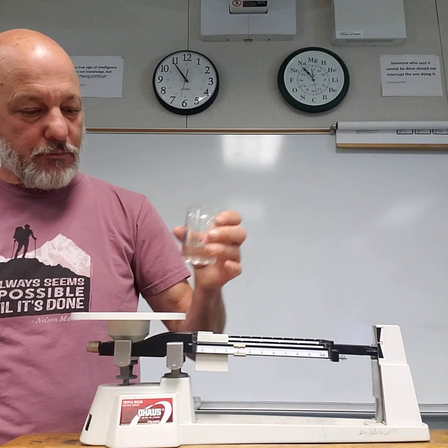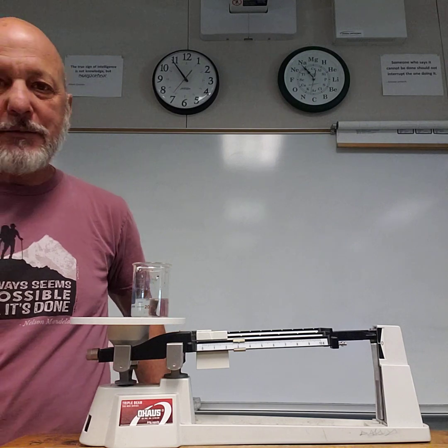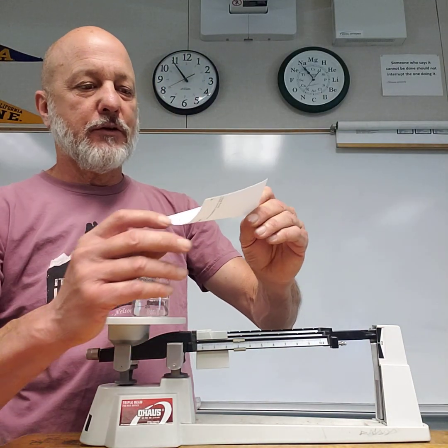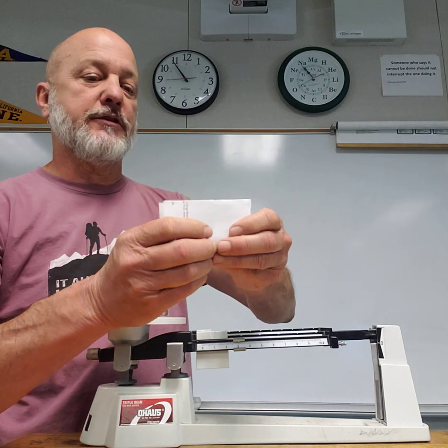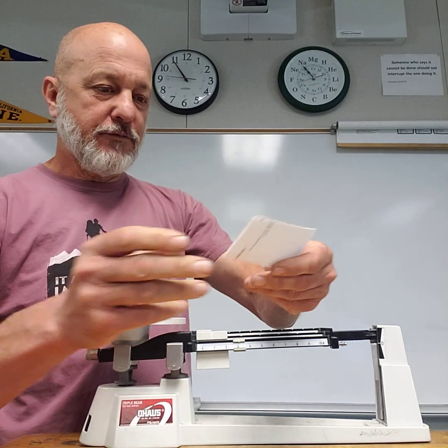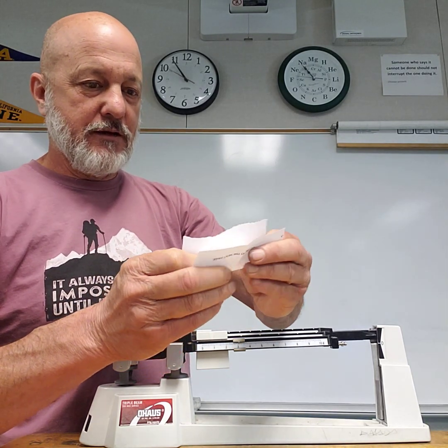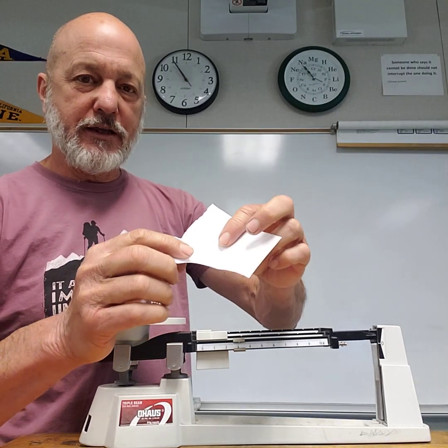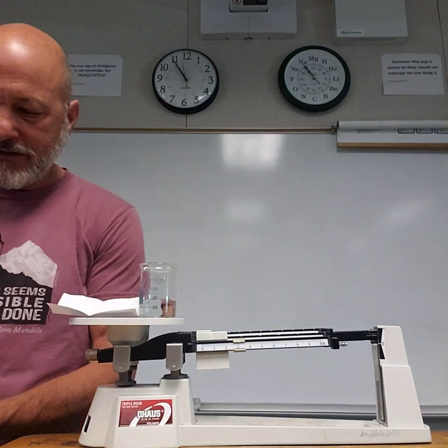So you put a little bit of water in there, and then the other thing I put in, fold a piece of paper. Even in an engineering lab, you say, well, this is kind of a crude way to hold a solid, but even in the engineering lab, we would use this for some substances. You just fold it like this, and then fold it again this way, and it kind of makes a little tray. I'm going to be just not very precise.